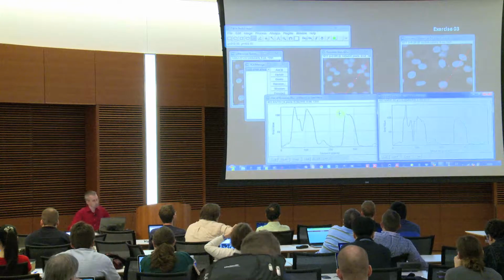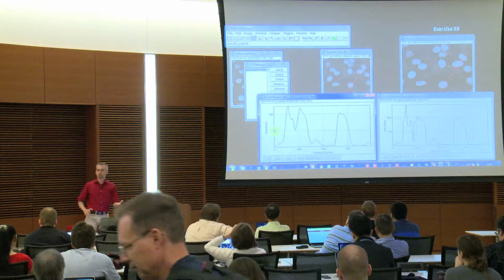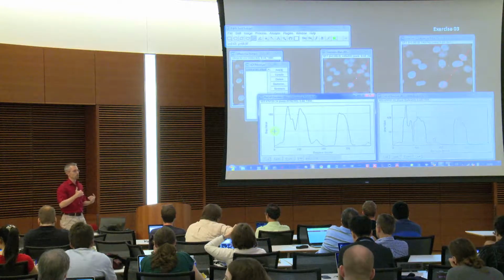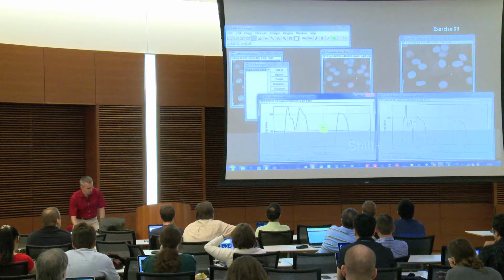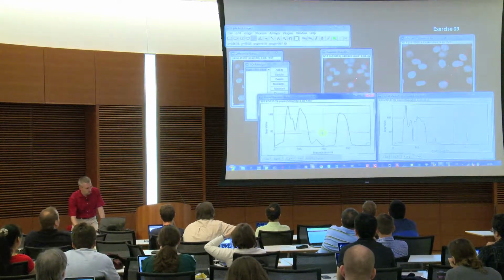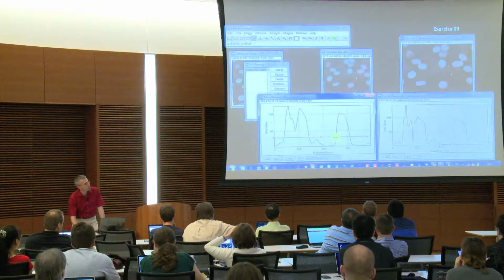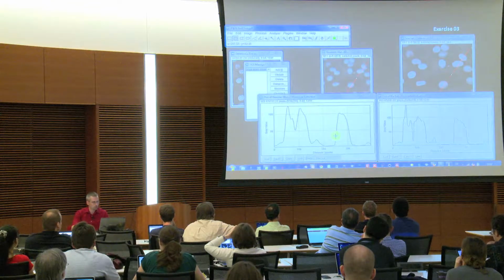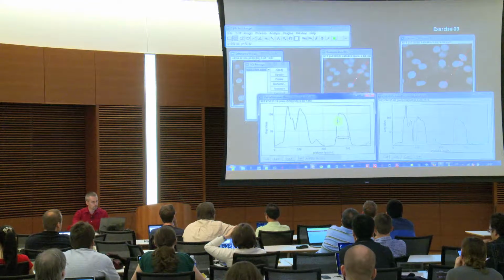So and potentially that makes a little bit clear what the problem later on is. We extract our objects with a threshold. The threshold is simply an intensity value at which the image is divided into interesting, not interesting. So the problem is if I would just indicate here a cutoff, which I would use, and then you imagine that this cutoff value is higher or lower, then you see in this object what I extract. If I do it here, my object, just to indicate that, if I would do it at this level, my object would have that size. And if I do it at this level, my object is smaller.